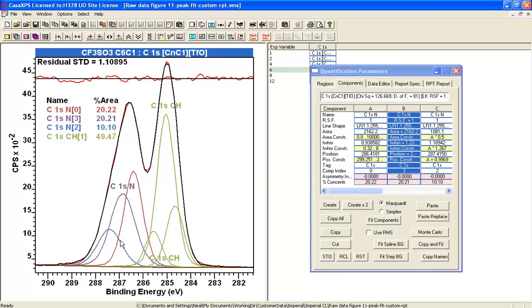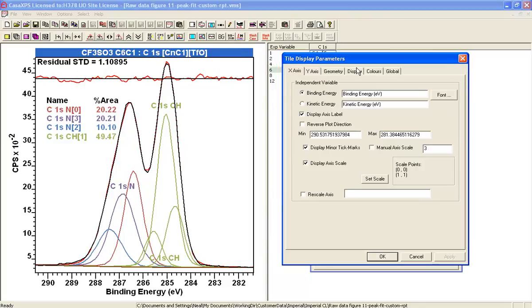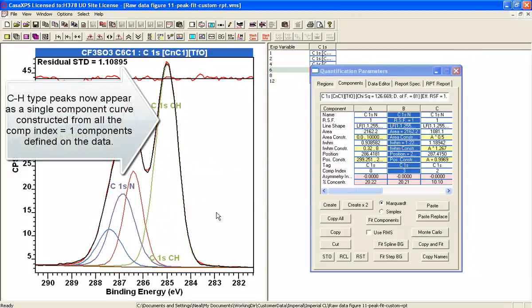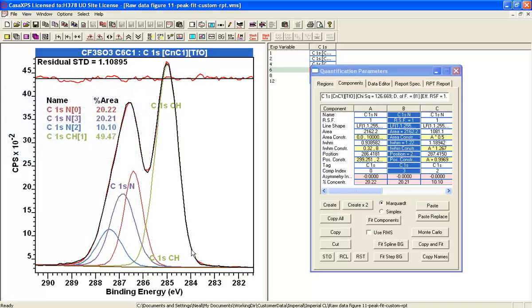So now we have a clear vision of these different component peaks associated with nitrogen. We've got a combination of three — actually four — peaks for this CH type bonding. We can represent this by combining the component index, so we can see that all of these CH peaks contribute to give a line shape which can be associated with carbon bonded to hydrogen.